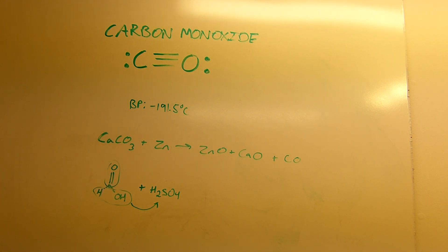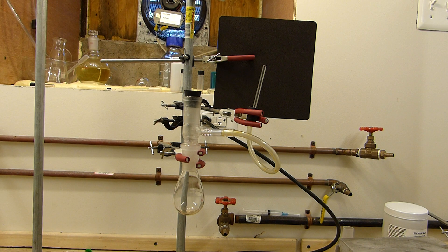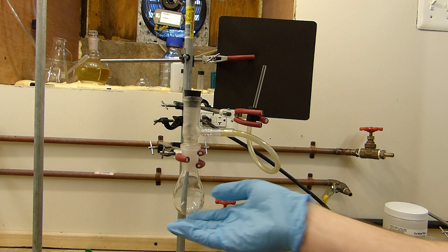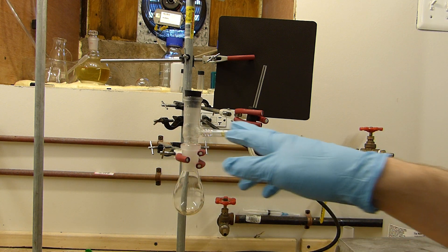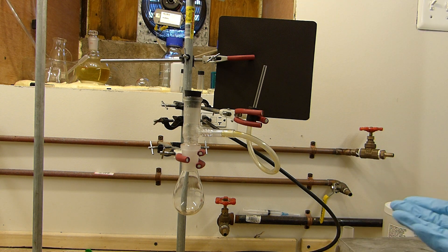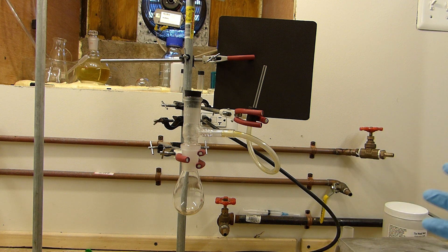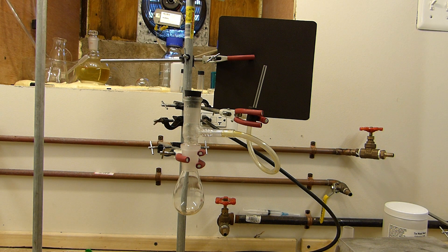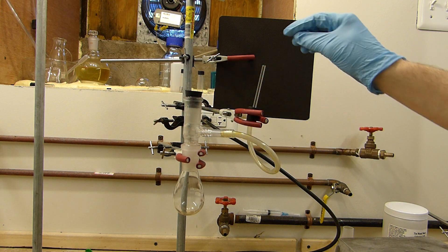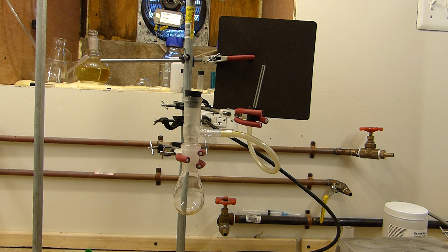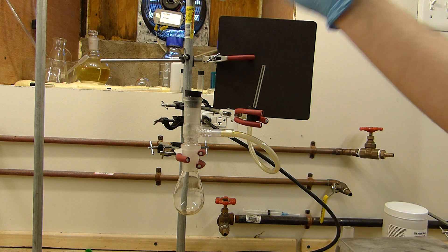I've set up a demonstration carbon monoxide generator, which consists simply of a flask where you can place the concentrated formic and sulfuric acids and then heat them gently, which will evolve the carbon monoxide gas. In this case, the carbon monoxide will just escape this tube, whereupon I'll burn it at the end of this glass tube to show the flammable properties of carbon monoxide. In a laboratory setting, you'd probably have some sort of gas drying train, followed by an absorption unit, and then some scrubbers after that. This apparatus is designed to be explosion-proof — since carbon monoxide is flammable, it will explode in a confined space when mixed with a sufficient amount of air. The stopper is placed loosely so that if the CO ignites near its explosive limits, it'll just pop the stopper rather than destroy the glassware and spread acids everywhere.